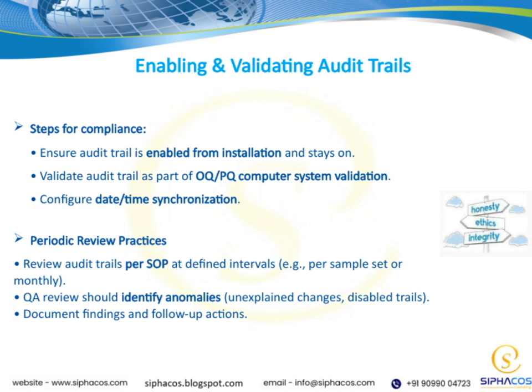This step confirms that the system reliably captures all necessary data. Additionally, configuring date and time synchronization is essential. Accurate timestamps ensure that every event is chronologically recorded, which is vital for traceability.